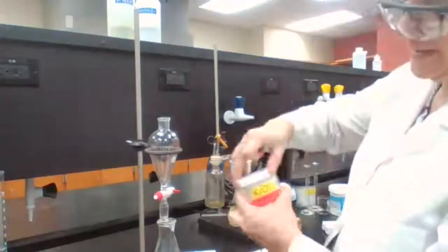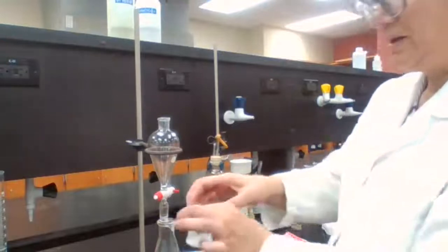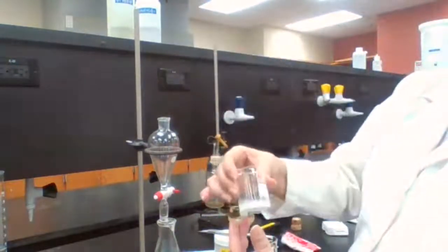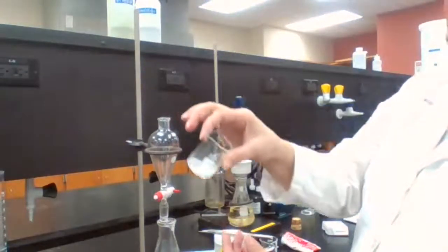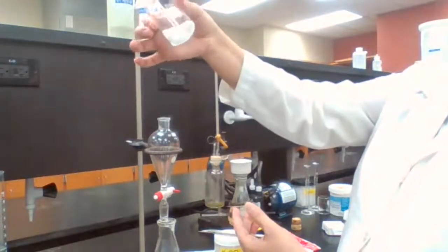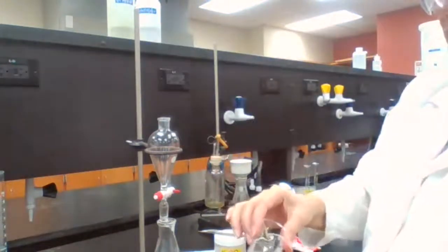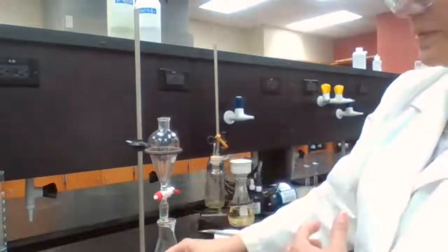Either my calcium chloride has been open and is not absorbing, or I have too much water mixed, because it took like 3 or 4 spoon spatulas. It wasn't a full spatula, but it took a lot. Okay, looks like it's enough because the calcium chloride is not clumping. I'm just going to wait until the water is absorbed.